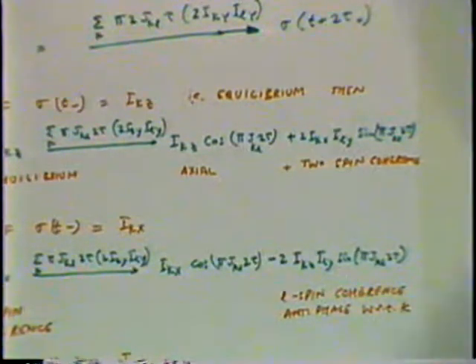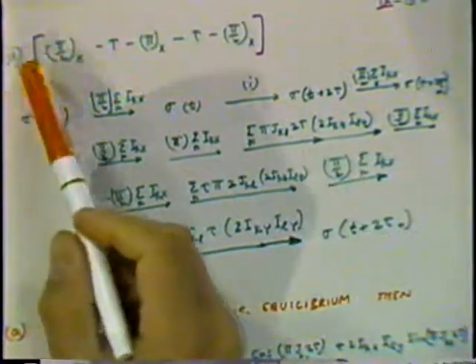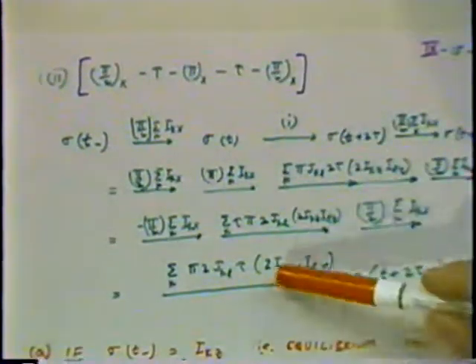which will be a coherence transform from spin K to spin L. And if sigma was IKY, this sequence will do nothing to it. But this was not apparent if you just look at sigma equal to IKY and apply the sequence, it is not apparent that this sequence will do nothing to it. Okay, but you can break it down and make it a simpler one.